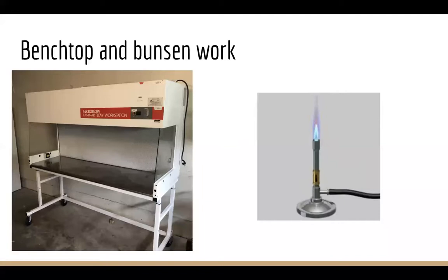And there's another way, which is for if you want to work with a larger amount of plates. So for example, if you're a big lab, or if you're working with many, many plates, you're setting them into agar, you might want to have a big microflow cabinet. And these are much more expensive. So in the UK, they can be like £3,000 plus new, or even more. But I was just talking about that website, which you can get them a bit cheaper.